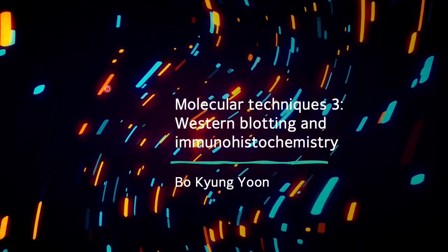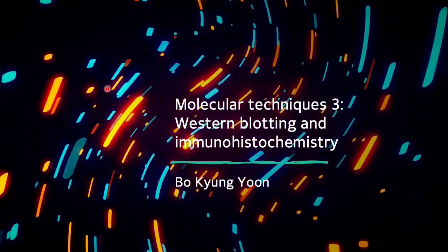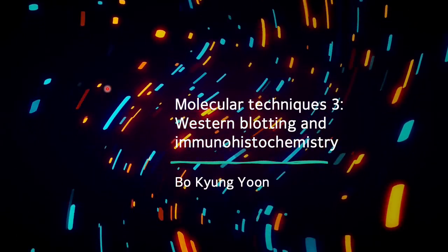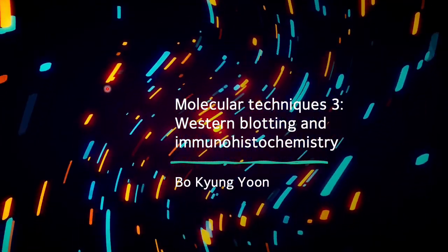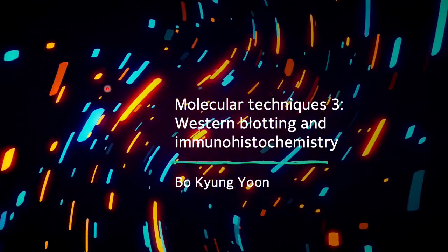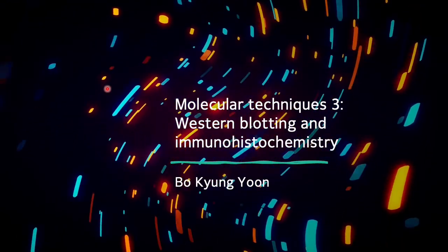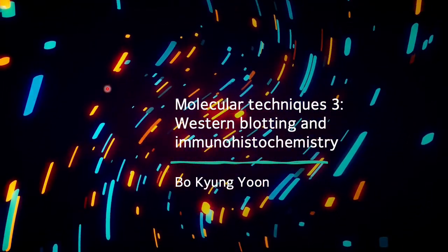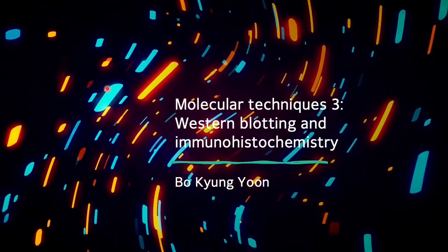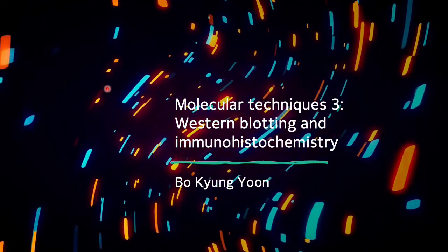Immunohistochemistry is performed mostly with tissues, but Western blotting is done with various types of samples, including tissues, cell lysates, and everything. So it's pretty much done every day in the lab. So you should understand what Western blotting is, understand the general process and the object of doing it.